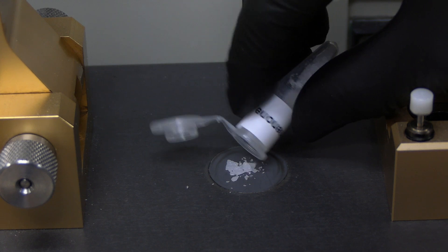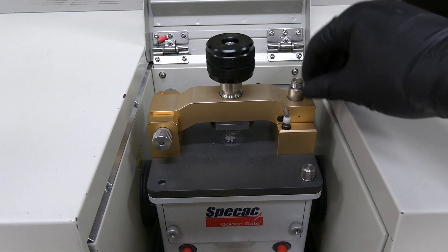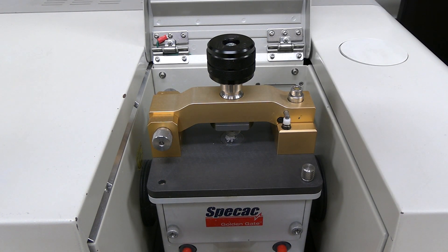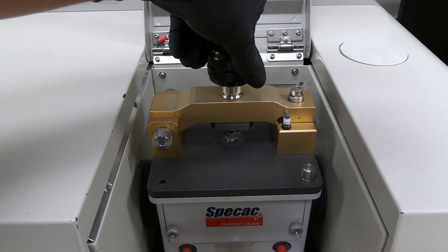Place enough sample to completely cover the sample window. Close the anvil arm. Press the locking lug and turn it clockwise to lock the anvil arm. Turn the anvil knob clockwise until the knob is finger tight. Do not over tighten.